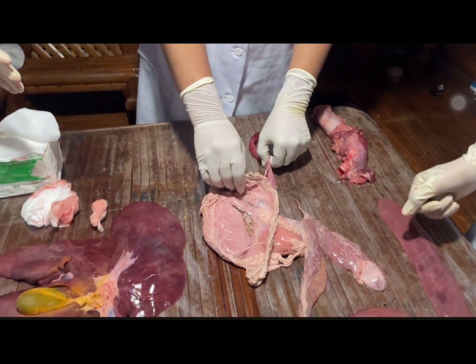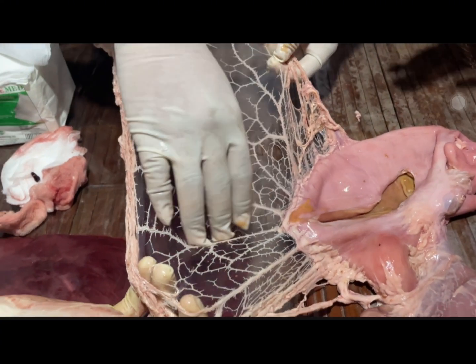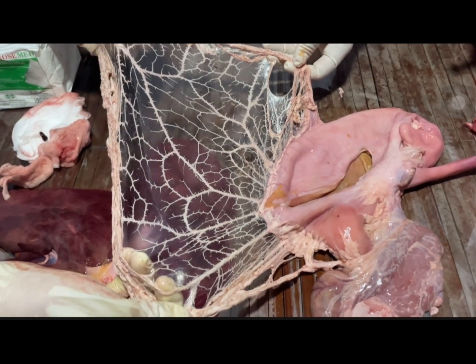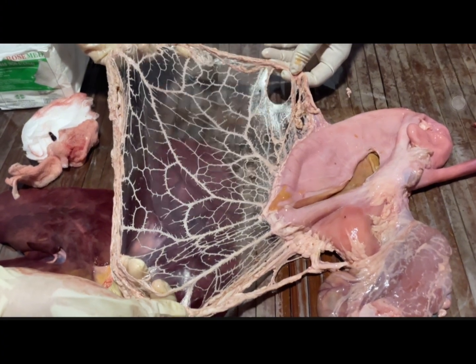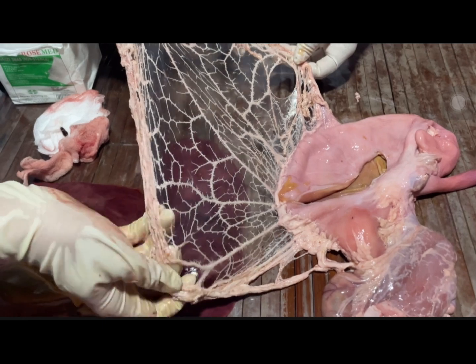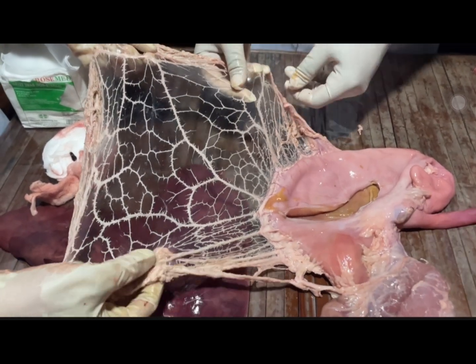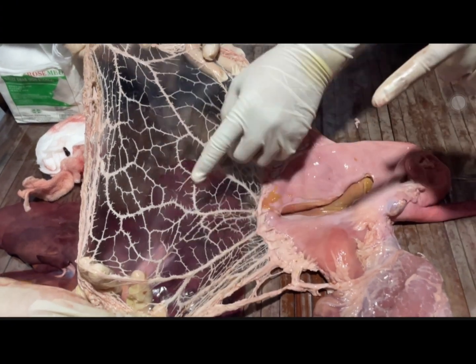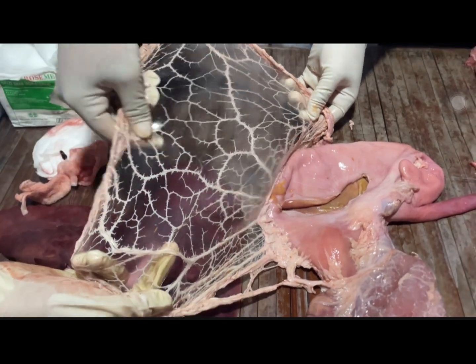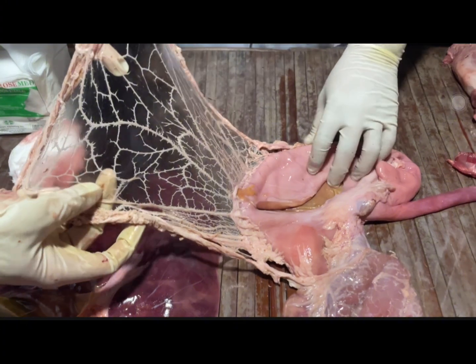So as you can see here, this is the omentum. The omentum is a large fatty tissue structure in the abdomen. It plays several important roles. It helps cushion and protect the abdominal organs, and acts as a physical barrier against infection. It can store fat, and it can also help in the healing of damaged tissues by promoting tissue repair. And it keeps the stomach in place.